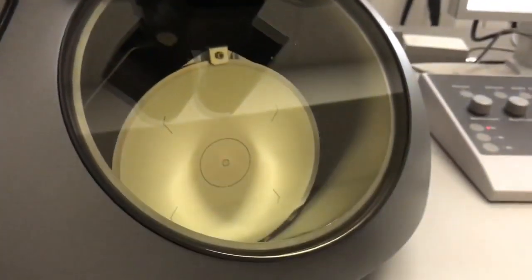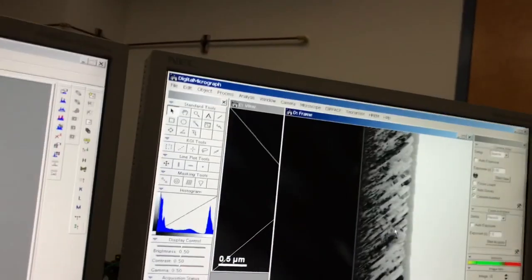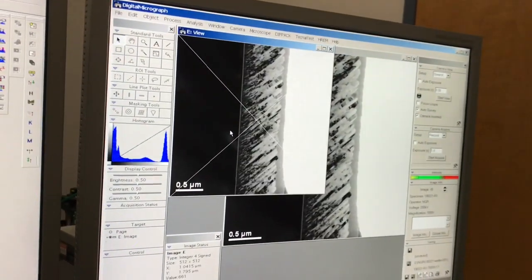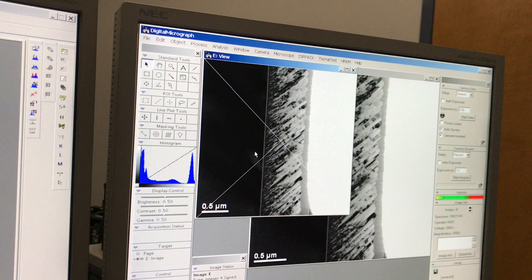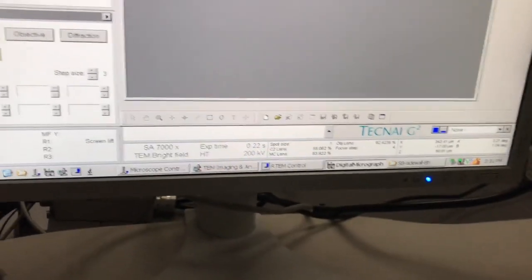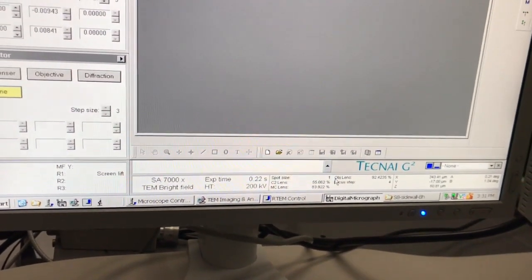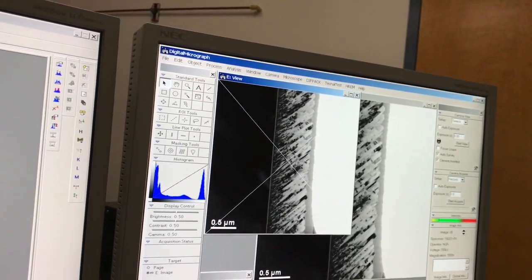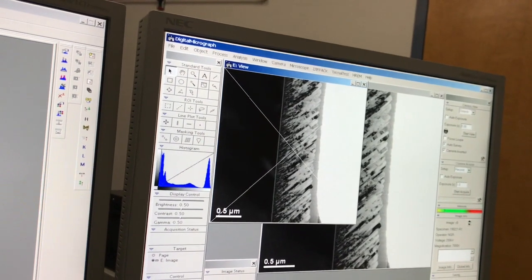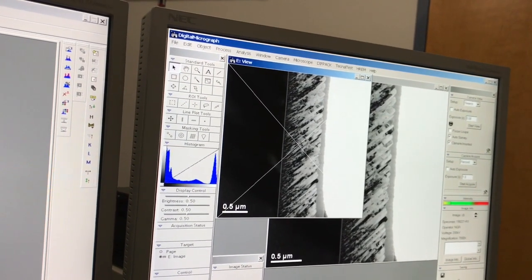Now one thing I'm not going to do, okay, I'm not going to push the diffraction button and put a diffraction pattern up here, okay? And the reason for that is I'm probably going to destroy my camera scintillator if I do that. Okay, so right now I'm using beam conditions, so we see spot size 1. I'm using really high current beam conditions which are great for imaging. They're not really good for recording diffraction patterns because, most importantly, you're probably going to damage the camera. Okay, so we'll talk about how to set up the instrument for recording the diffraction pattern in a minute.